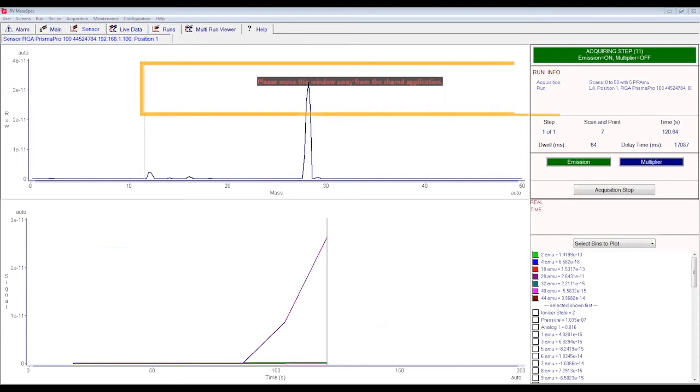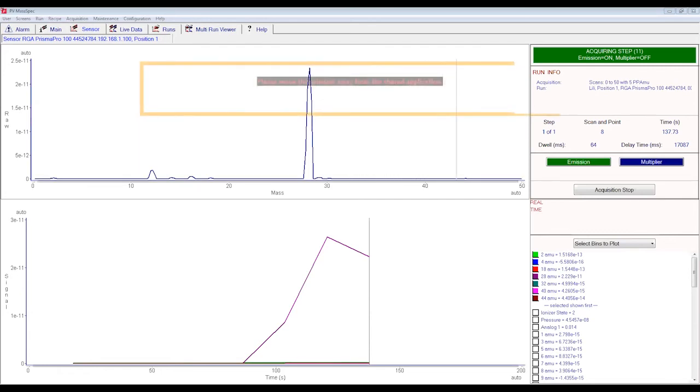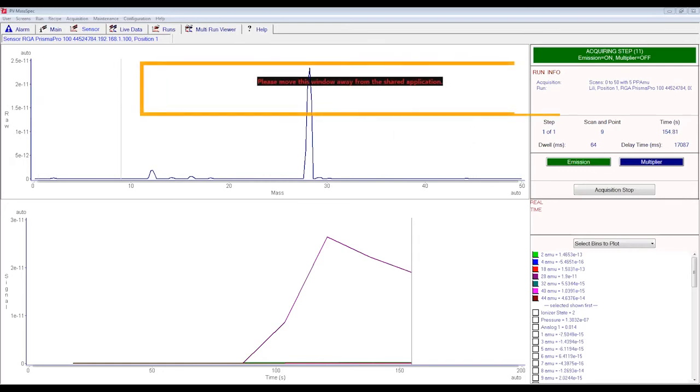The gases in the cell can also be converted on the stage, or the stage can influence the mixture a bit. So you can have products which come not directly from your sample, but from the stage and other hot parts inside the cell. Usually, in order to be sure that what you see by the mass spectrometer is directly from your sample, you first need to do a blank experiment. It means to install, for example, some silica, which has the same size and no reactivity.